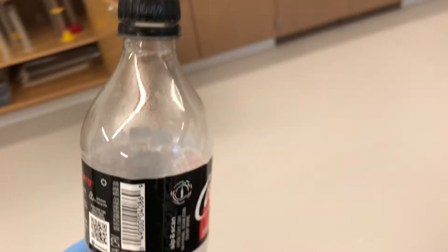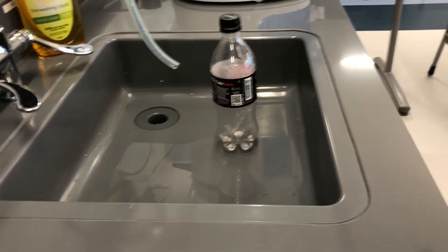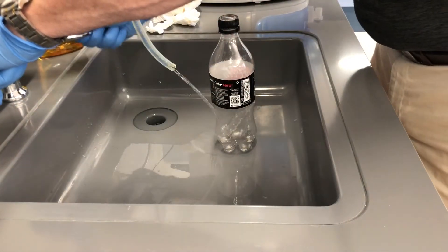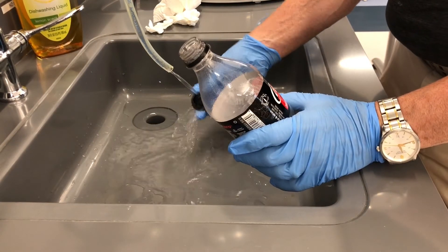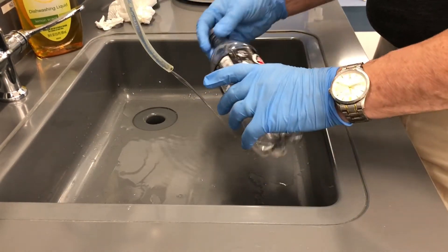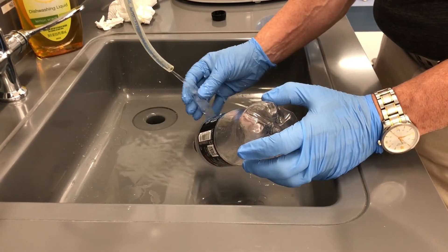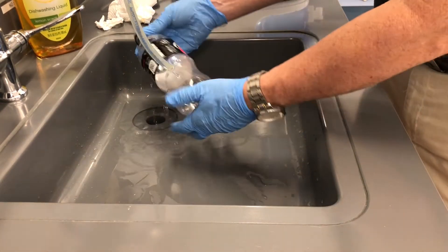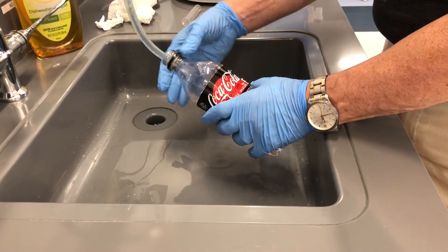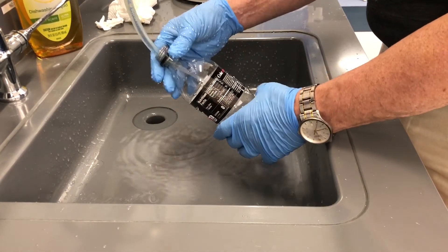We've got to go over to the sink. I'm going to have to clean things out before we're done. Turn on the water. I'm going to rinse out the cap and we're going to dry this stuff in a minute. I'm going to catch the test tube so it doesn't hit the bottom of the sink and break. Rinse that out, and now I'm going to wash out the bottle — I'll do it at least three times, because you don't want to leave anything in there since somebody else is going to come along next class.